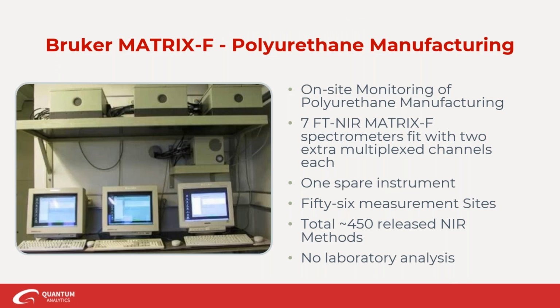So here's a place where they're actually using these instruments, and this has been going on for quite a while. So they're using the Bruker Matrix F for polyurethane manufacturing. So this was implemented all the way back in the early 2000s, and it is still going on today. So if you don't believe me, take a look at those monitors there. When I looked at those monitors, the first thing that went off in my head was the AOL sign-in and You've Got Mail. They've been around and been there for quite a while.